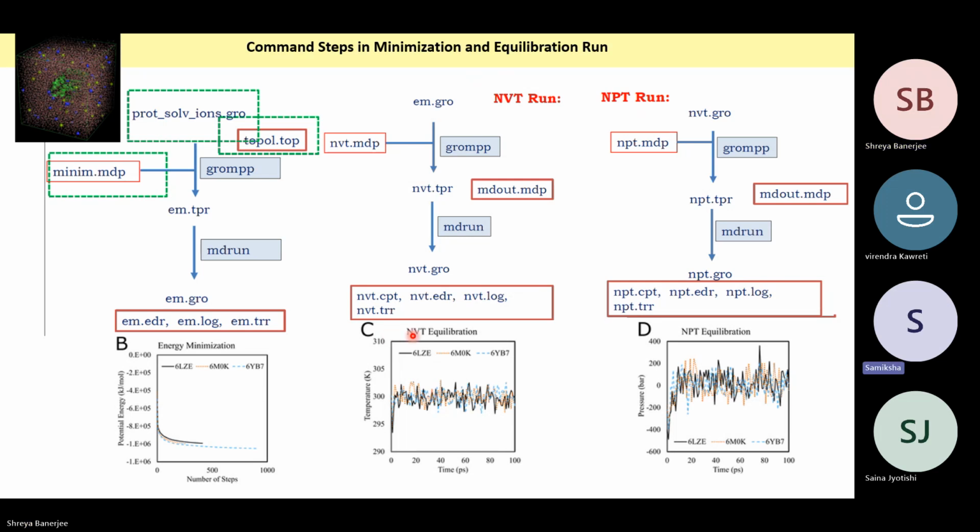Where will we put all the NVT results? They will come as different graphs, and then you can get the coordinates of the graphs and plot them together in some plotting software like Origin. Origin. Okay.